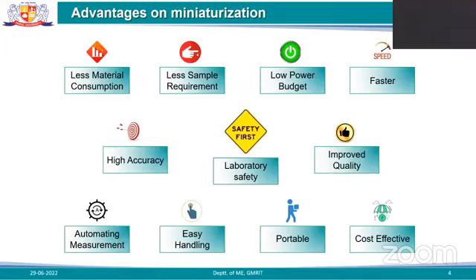it requires less material. Whenever the whole device or whole system is going to be of very short size, a miniaturized device, the material consumption will be very less. So that is one advantage.